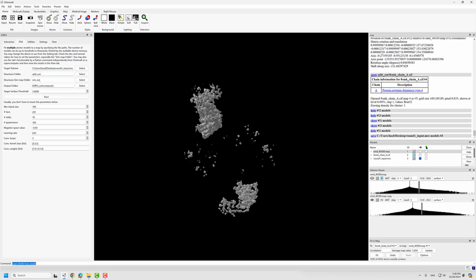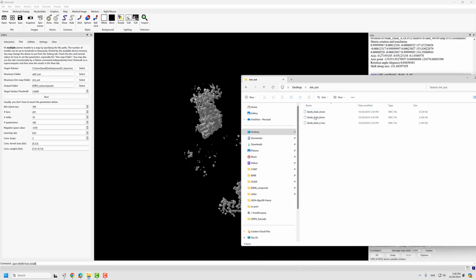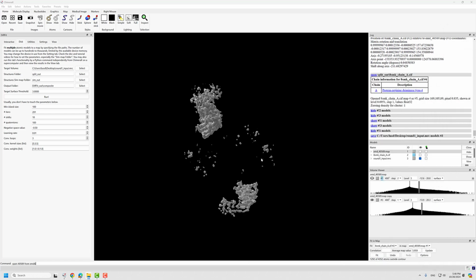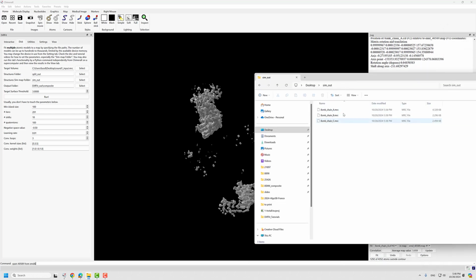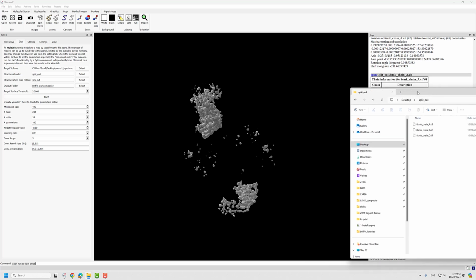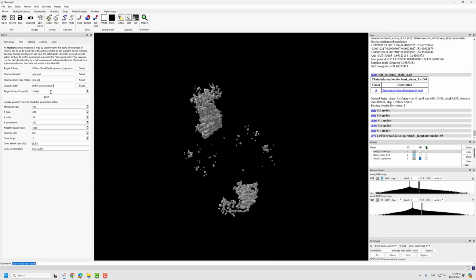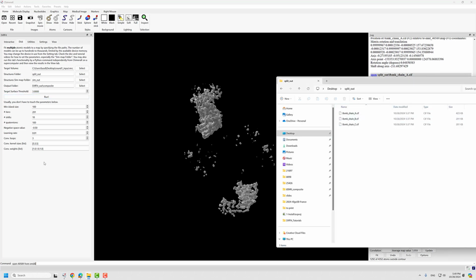Now what we can do, we can remove the chain A already, because we know the 2 occurrences of chain A have already been fitted. It's fine. Let's try just without removing it. Let's see what's the result. Sometimes in this case, the number of subunits is not huge, so it will be fine. It will still be able to find the result, but this will create some noise, of course.